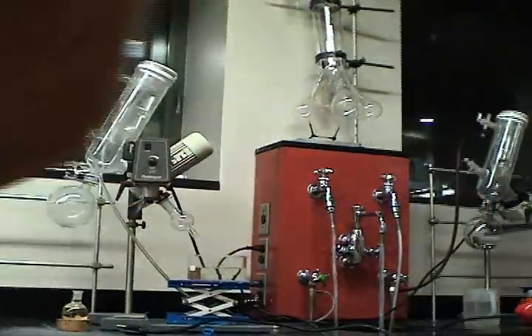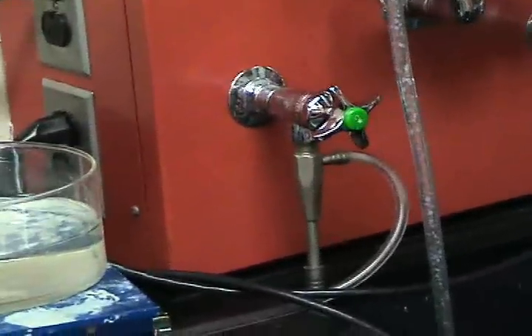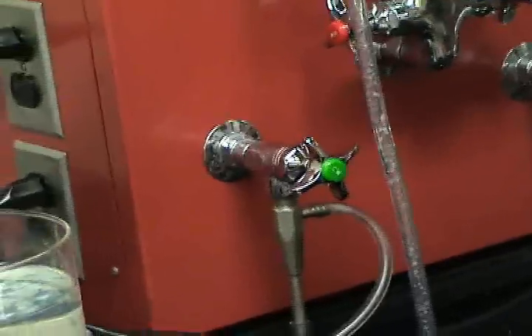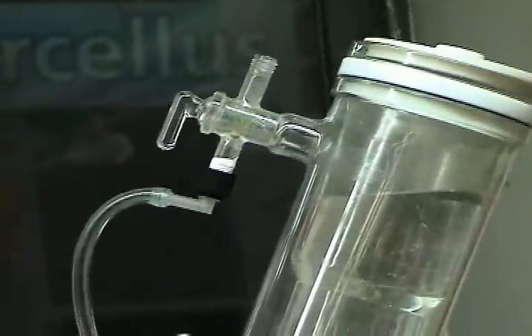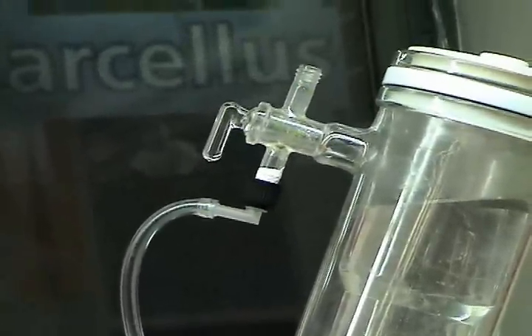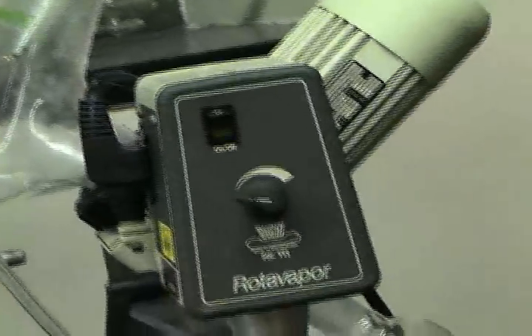Let's go over some of the machine anatomy. This is the aspirator. It looks just like a sink faucet with an attachment. What it does is the force of the water being pushed out pulls a vacuum through this tube and to the machine. That stopcock has to be facing down in order for the vacuum to be pulled through the machine.